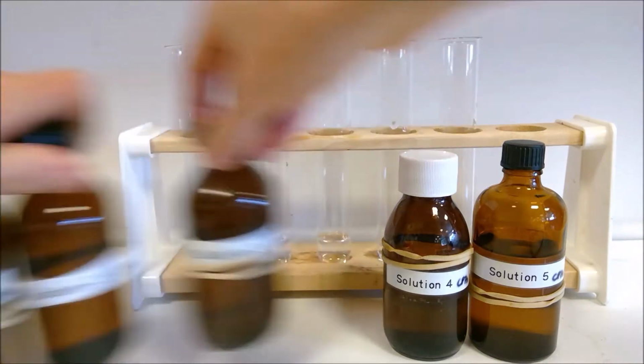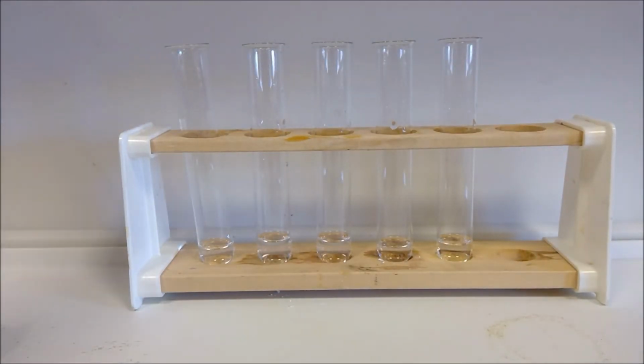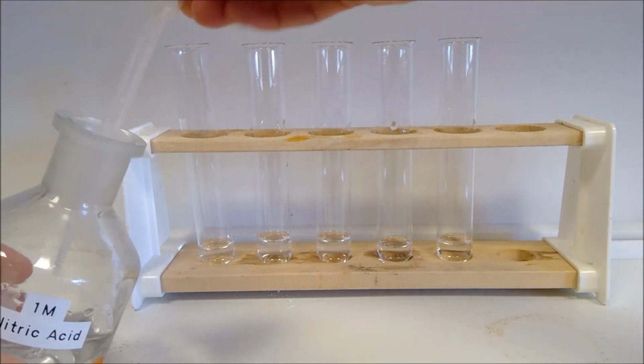So first of all, I've already poured my solutions into the different test tubes here. And we're going to add nitric acid to each of these in turn.